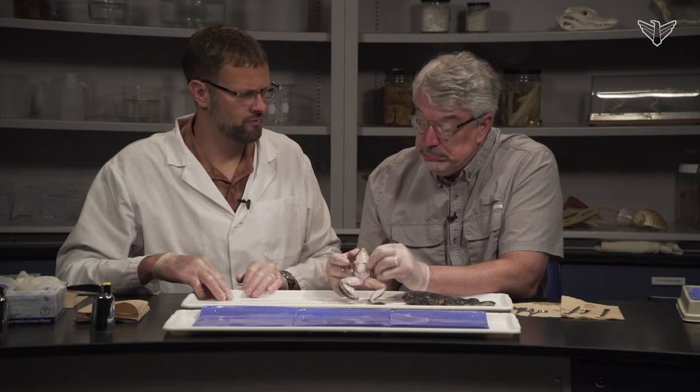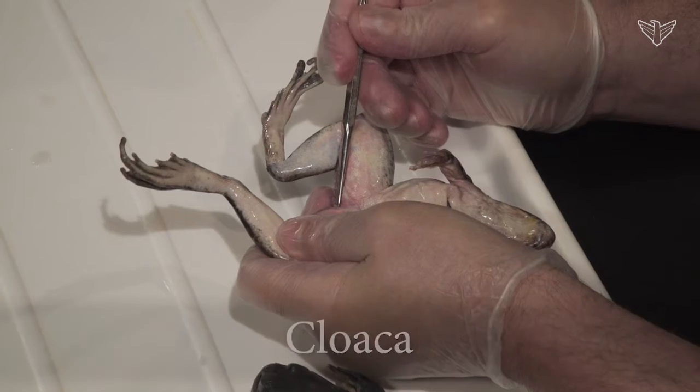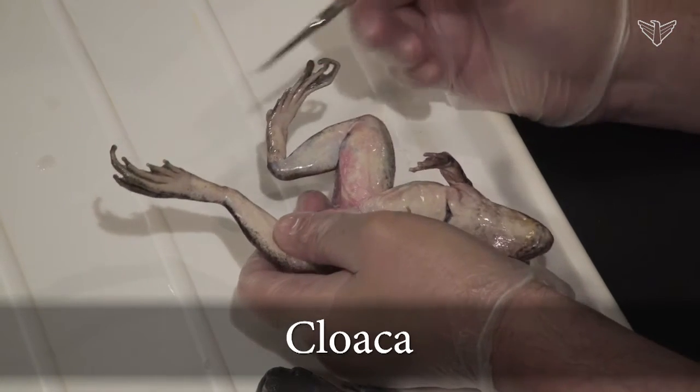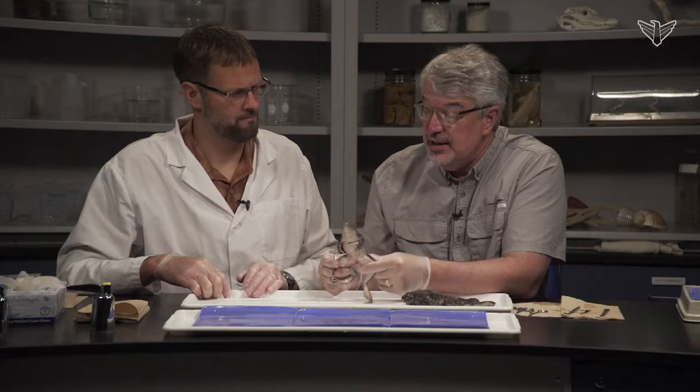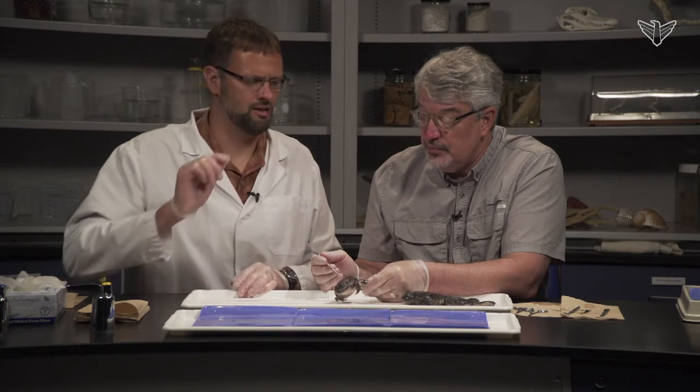Externally, there's the opening to the urogenital and digestive systems, the cloaca, a common opening. Other than that, externally, they're pretty simple animals. Was there something about the tongue too that you were mentioning?